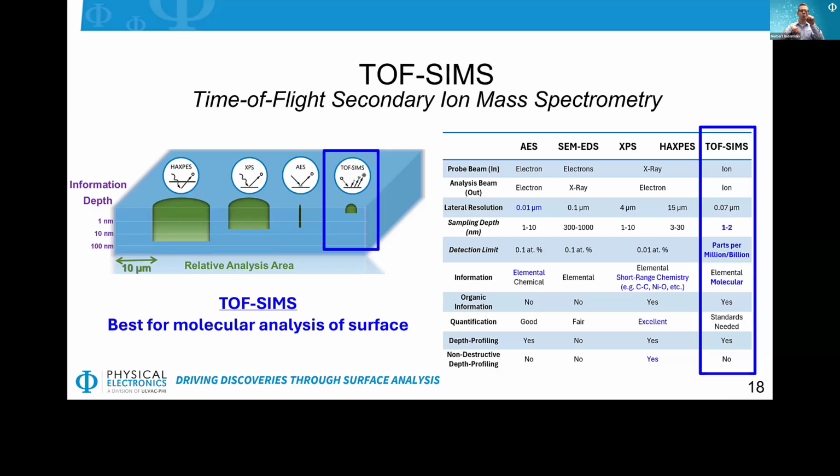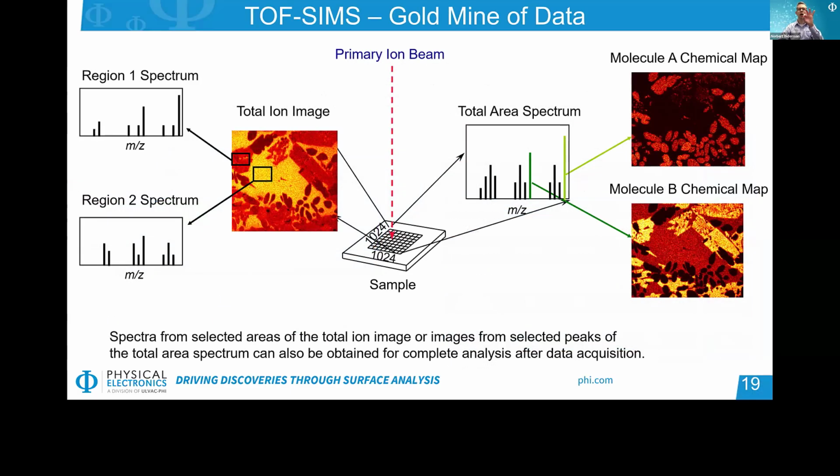The liberated molecules often come from only a few monolayers below the surface, making them extremely surface sensitive. So TOF-SIMS collects both surface-sensitive data on elements and molecules within the first several monolayers, as well as imaging their lateral distribution via secondary ion images. The distinguishing thing with TOF-SIMS is that we can image large molecules, unlike Auger and XPS. This application of molecules is critical to industries where polymers play a large role, such as paint, filtration, and adhesives.